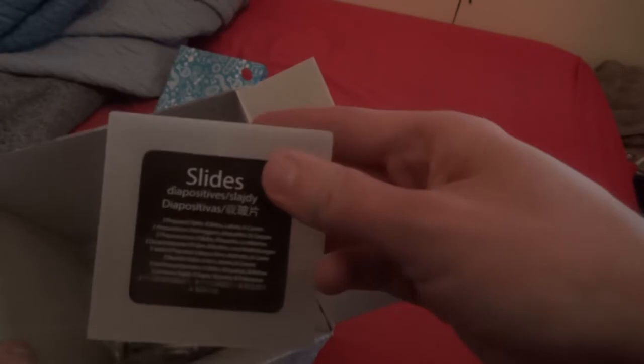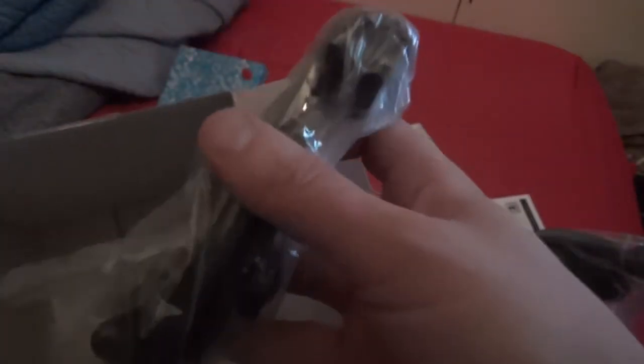Anything on the back of it? Nope. So let us put it to the side. Here we have some bits to stop things from drying out. Here are the slides — we'll have a look at them in a minute. We also have what looks to be the smartphone adapter, a package full of stuff, the actual batteries, and what looks to be another mount as well. There's a lot to get through.